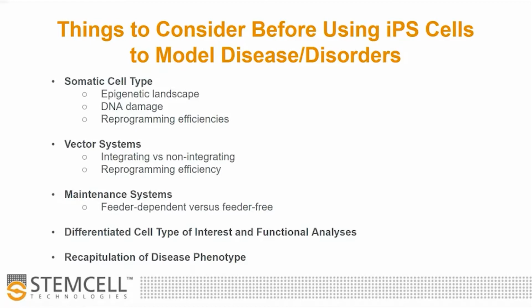The next thing to consider would be the vector system. And we'll talk a little about this today, but there are both integrating and non-integrating vector systems, viral and non-viral. And all of these have different reprogramming efficiencies as well, which have to be considered.